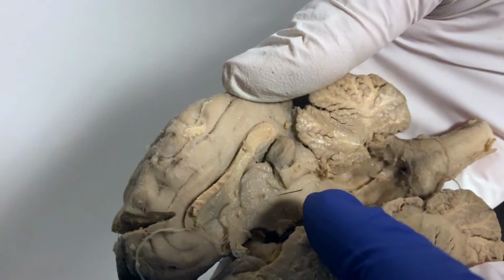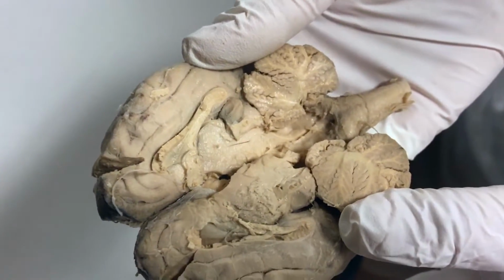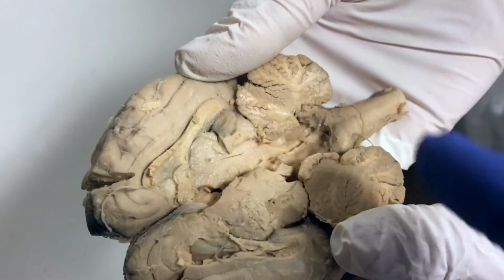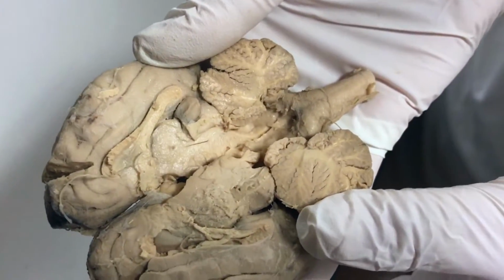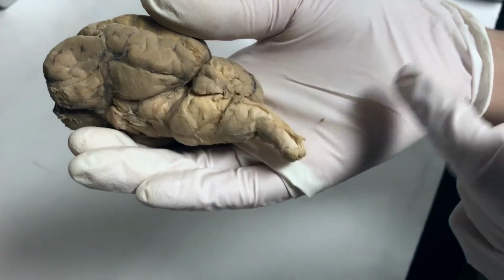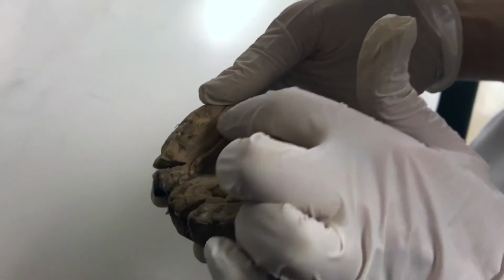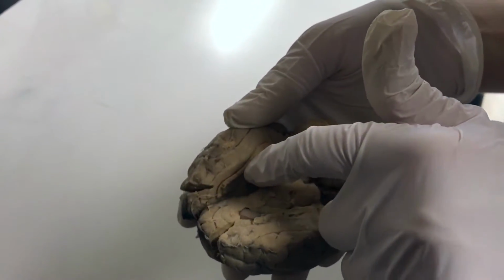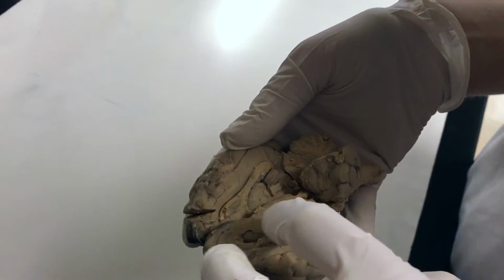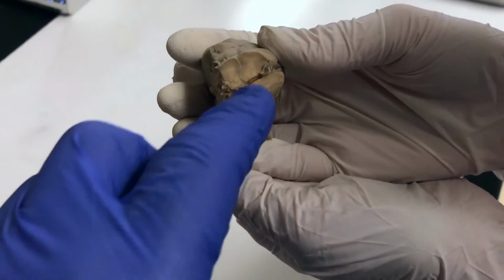And then deep down here is the midbrain, which integrates different sensory inputs and basically serves as a highway throughout the brain to kind of move things around to different parts and communicate. This right here is the brainstem, and as you can see, it's a little bit rubbery. Up here we have the corpus callosum, and right underneath it is the fornix. And then here is a hollow cavity, which is the lateral ventricle. This is the pineal. So right in this region is the thalamus.